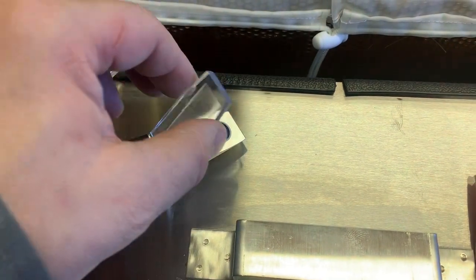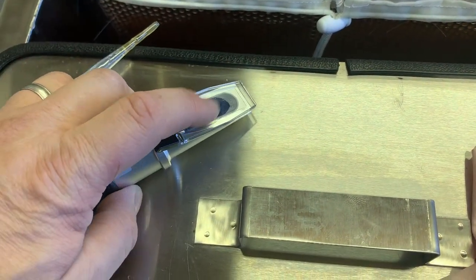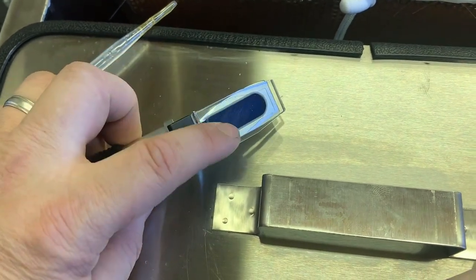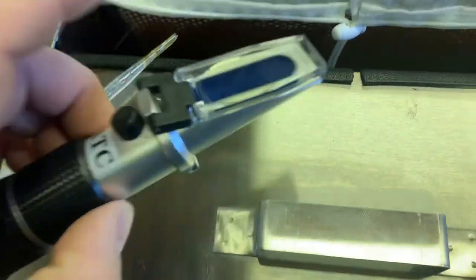Now we're going to close the lid of the refractometer and press it so it encompasses the whole area. You can see the honey spread out on the blue area.